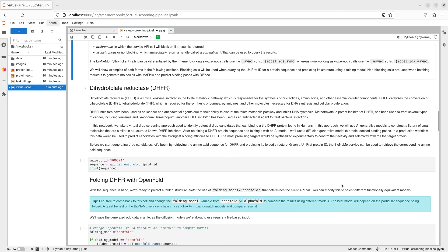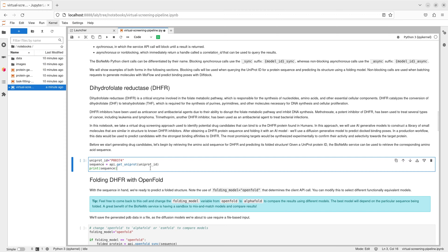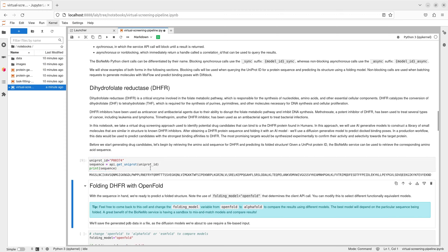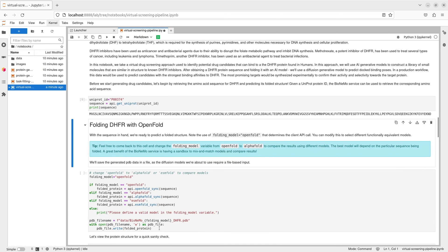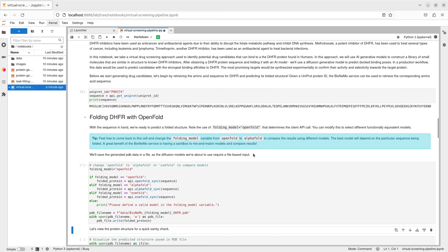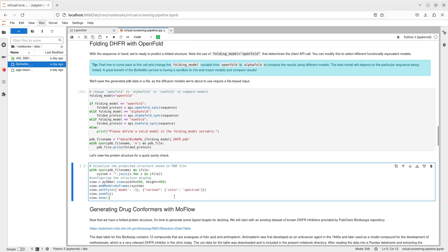Once we've verified access to the service, we begin by looking up the protein sequence for dihydrofolate reductase, or DHFR, a common binding target in drug discovery. We then use OpenFold to predict the 3D protein structure based on its amino acid sequence.